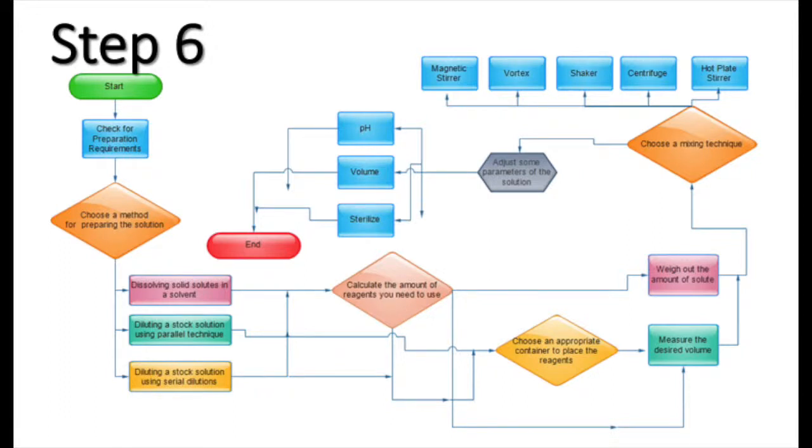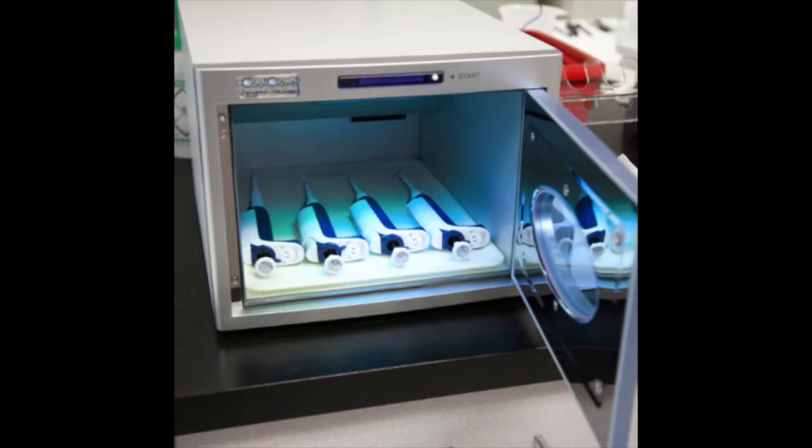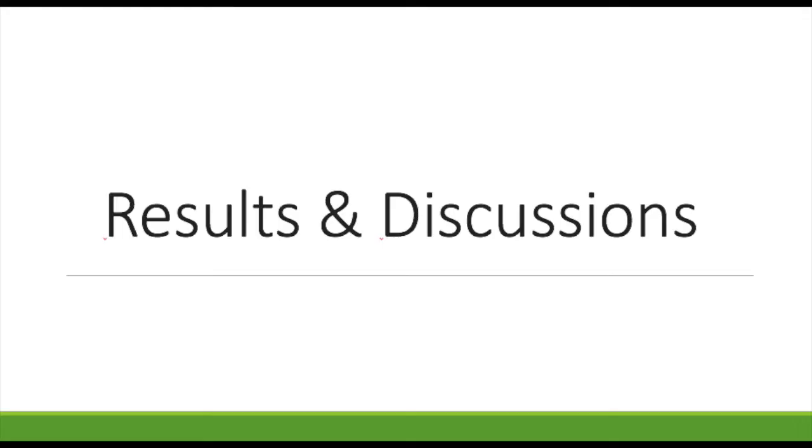Step 6. The various methods of sterilization are the physical methods, which include the thermal heat method, radiation method, and filtration method, and chemical methods like the gaseous method. Different solutions were made which are going to be used during the semester.